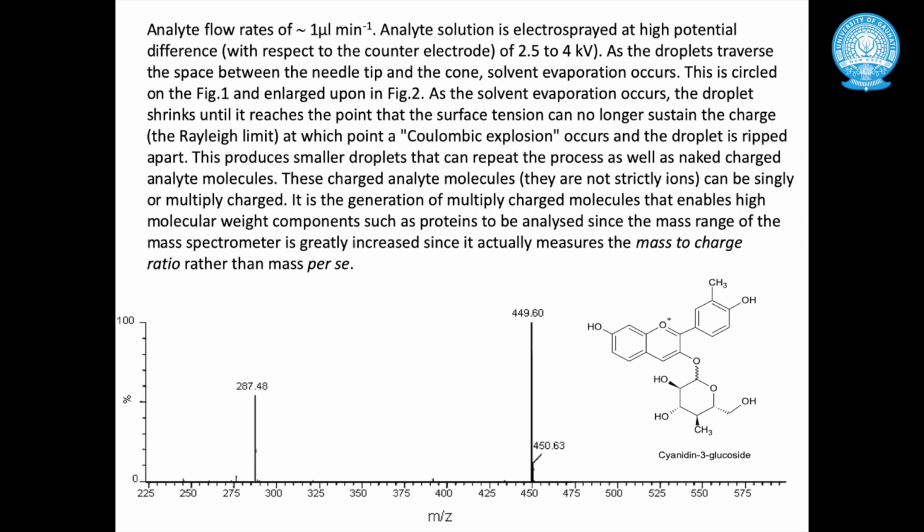Based on these peaks, we will be able to integrate the functional groups and the electronic density where the hydrogen atom is present, and that is how we will confirm the structure of the compound after knowing the molecular mass of the compound using the mass spectrometry technique.